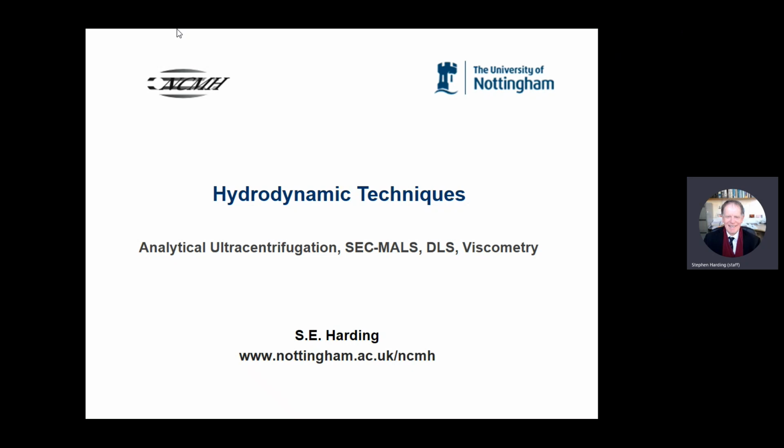We've done that in detail already, but I'll put it here because it links nicely in with the light scattering. SEC-MALS stands for size exclusion chromatography coupled to multi-angle laser light scattering. SEC-MALS.